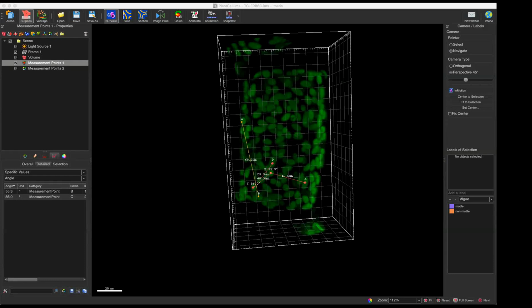So if you want to count the number of these sphere-shaped objects, then Spots is a good tool you can use. And Spots is good for detecting position as well. For a different shape of object, maybe not a sphere, if you just want to know the position information, maybe Spots is also a useful tool for you.